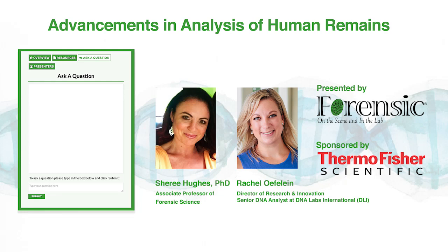Okay. Now you mentioned that salt water in Florida is great for the bones. What about temperature? Does temperature affect the quality of DNA extracted from bone? Yes, anytime you have really, really high temperatures, like explosions where there was maybe a sustained fire with high heat for a long period of time, that's going to affect the quality, as well as sometimes when we have samples from up north that have been exposed to multiple freeze-thaws, so you have the remains being frozen, and then come spring, they thaw out again, and then go through that cycle again for decades. That can also have a negative effect on the quality of the sample.